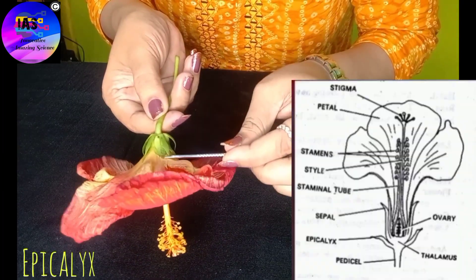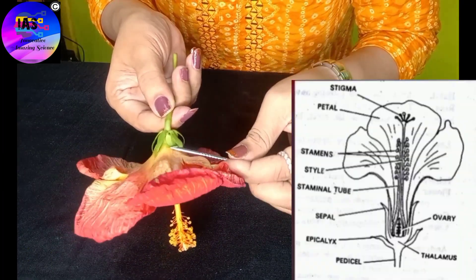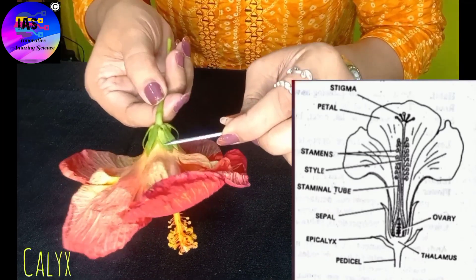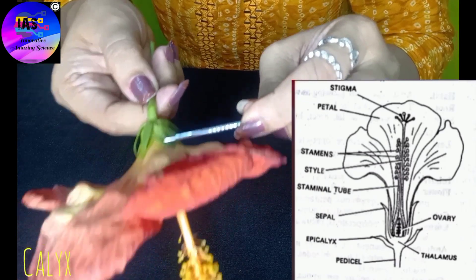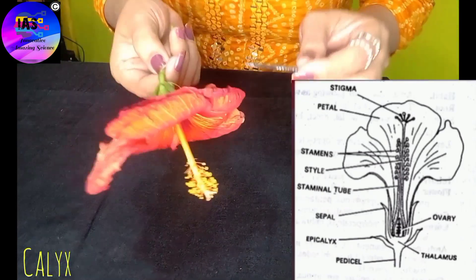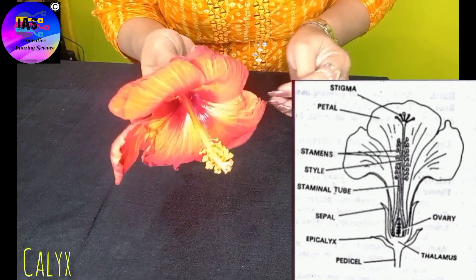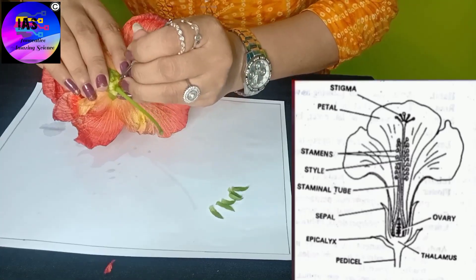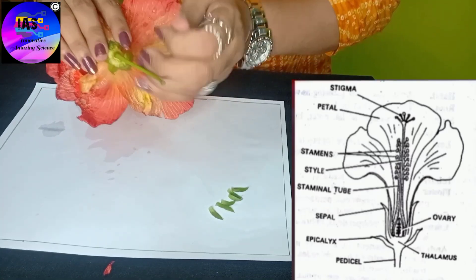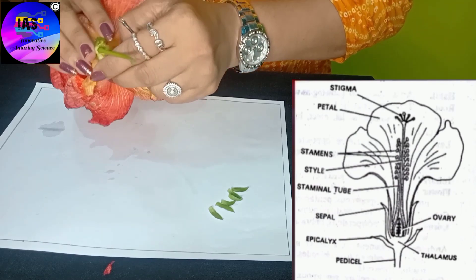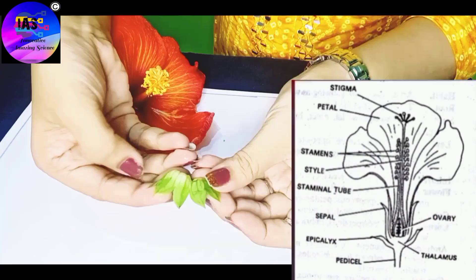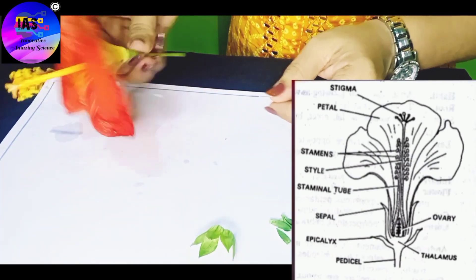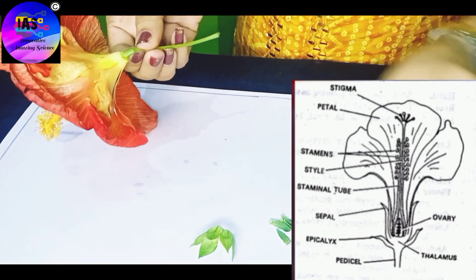Next to the epicalyx, you can see the outermost whorl, which is known as the calyx, and it contains a set of green leaf-like structures known as the sepals. Usually there are four or five sepals, and here they are fused, so they are called gamosepalous. I'll carefully and slowly separate the sepals, which are five in number.